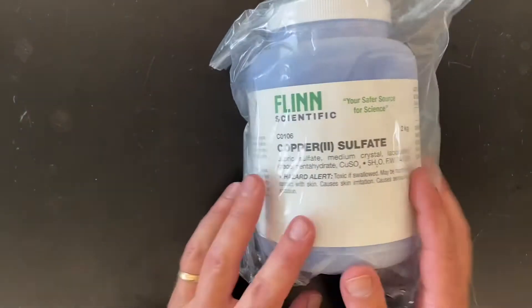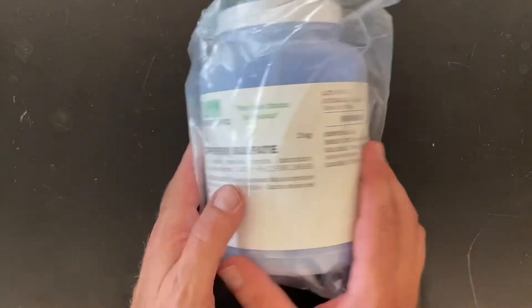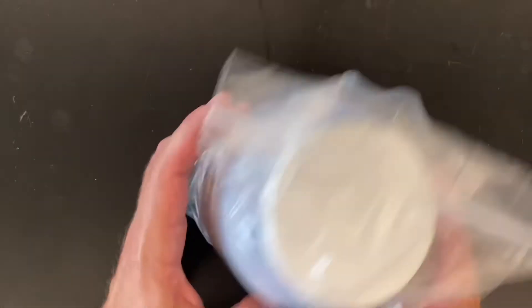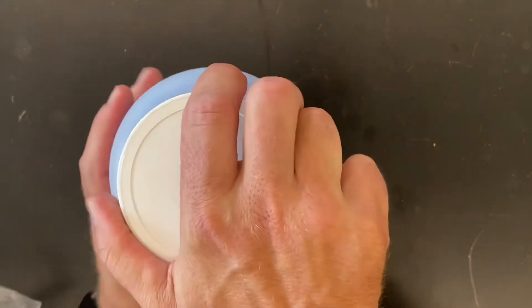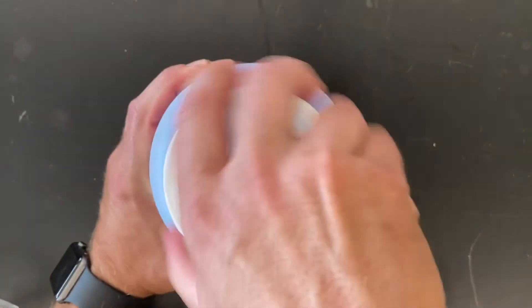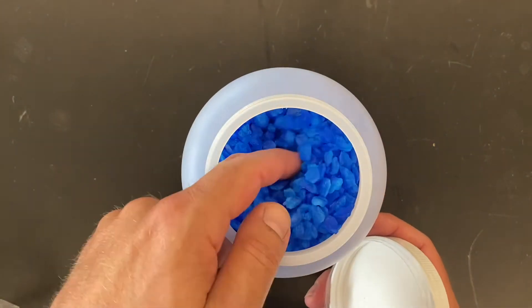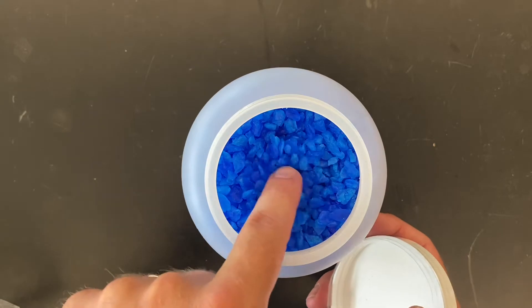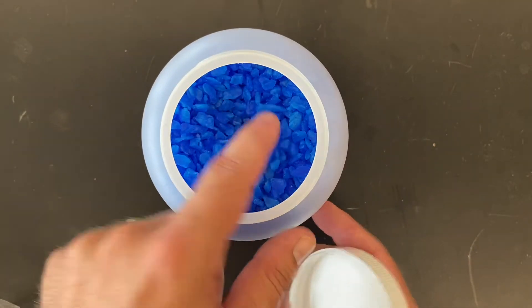After that is some copper(II) sulfate — we have three bottles of this. You'll note that it has a blue color because copper salts typically have blue or green colors. And look at these beautiful large crystals of copper(II) sulfate — that's fantastic.